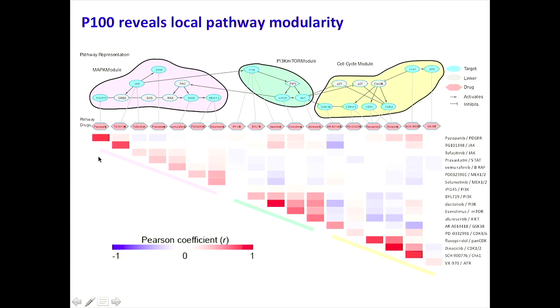But what's quite interesting is the off-diagonal correlation. Here you can see a block of off-diagonal correlation that's really only among these particular treatments, among these drugs. A second block of off-diagonal correlation relates to these drugs here, and a third block of off-diagonal correlation mainly concentrates itself in this region.